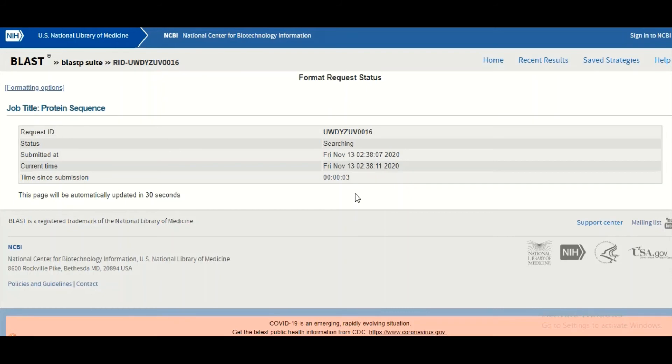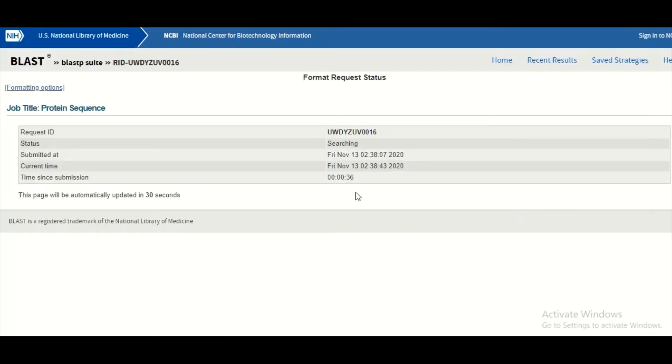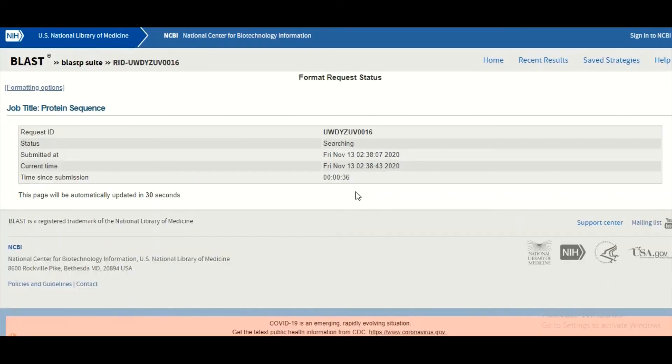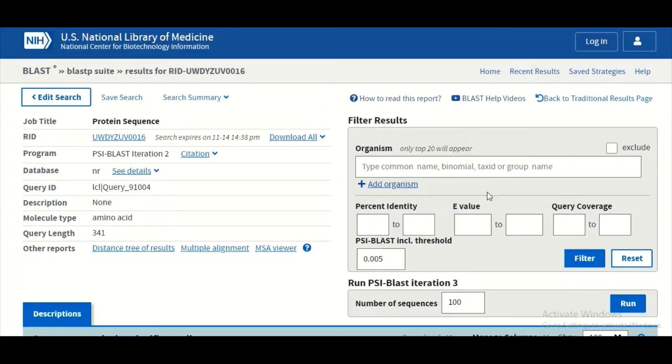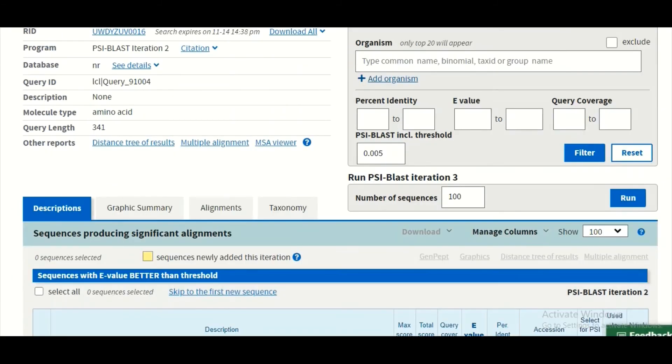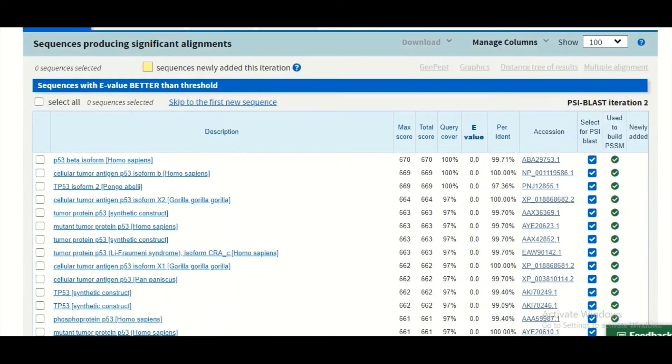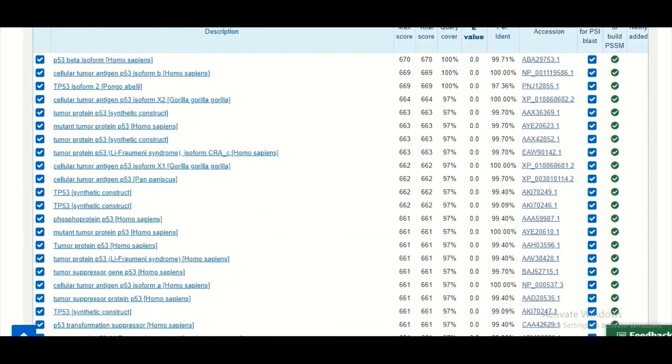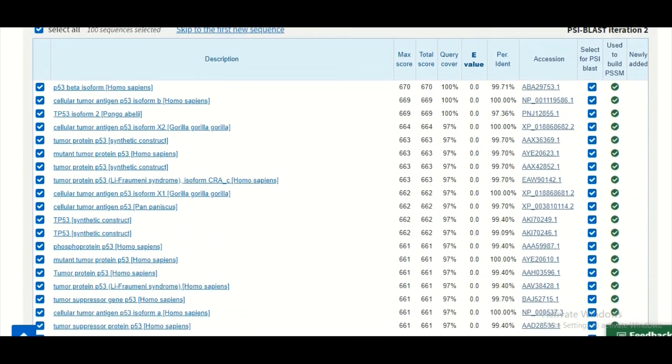That is going to be the second round. The second round search is started, and let us wait for the completion of the second round. So our second round is done.